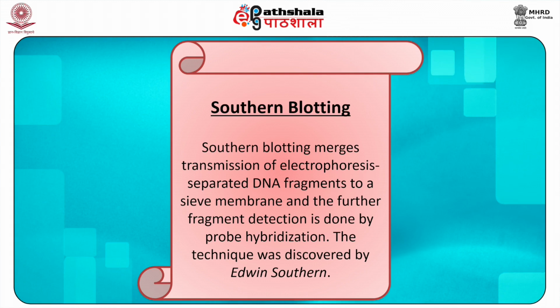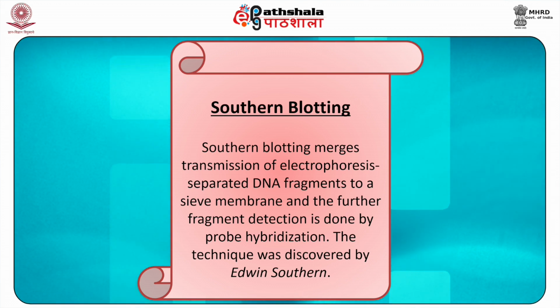Southern blotting merges transmission of electrophoresis-separated DNA fragments to a sieve membrane, and the further fragment detection is done by probe hybridization. The technique was discovered by Edwin Southern and hence the name southern blotting.